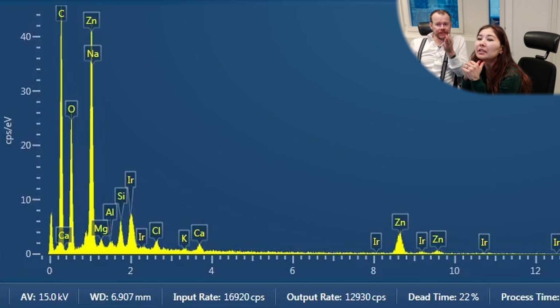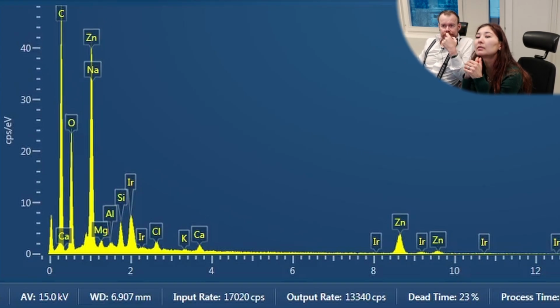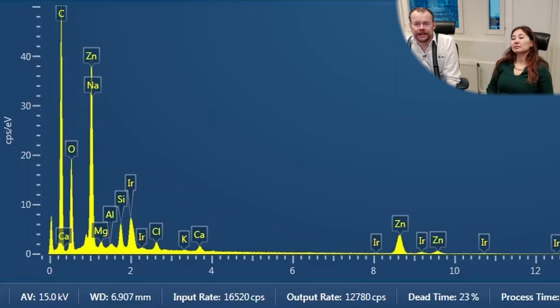Here it's some other thing. Or perhaps sodium. We will see how it evolves. Maybe it's salt, like you said. Aluminium. Potassium. Yeah, it's interesting. We see a lot of different compounds there. I didn't see any of those in my previous sample. But this is nice. These are all a bunch of metals at least.